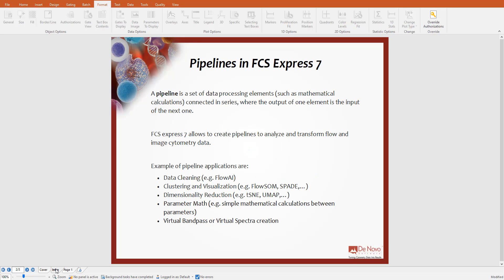A pipeline is a set of data processing elements, such as mathematical calculations, connected in series, where the output of one element is the input of the next one. FCS Express 7 allows you to create pipelines to analyze and transform both flow and image cytometry data.